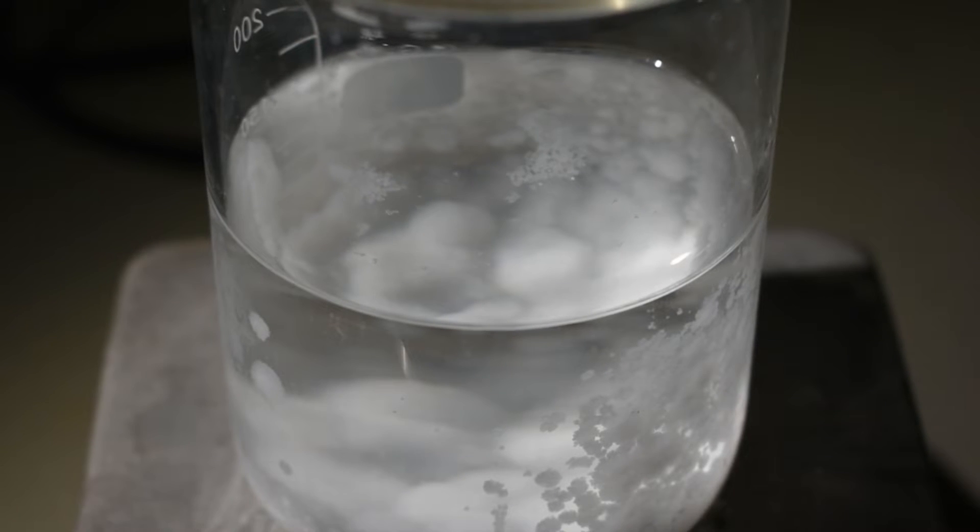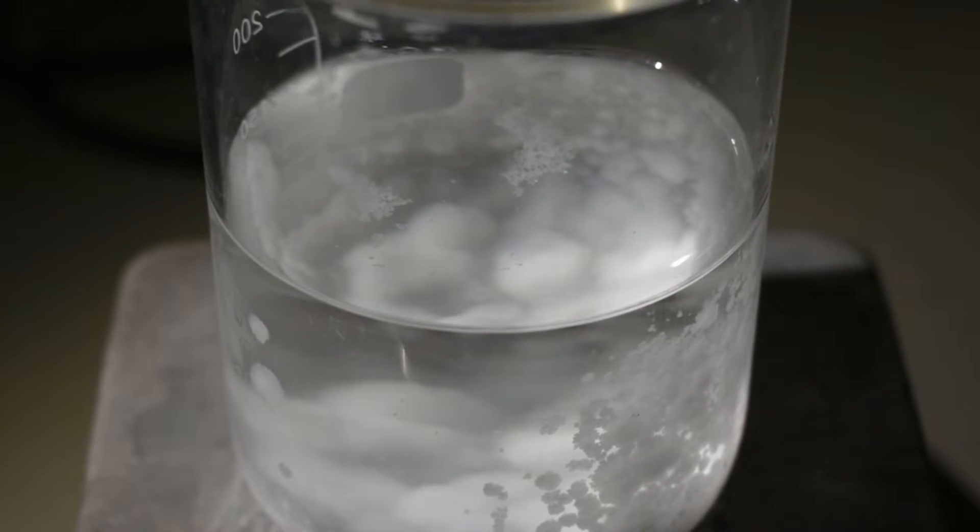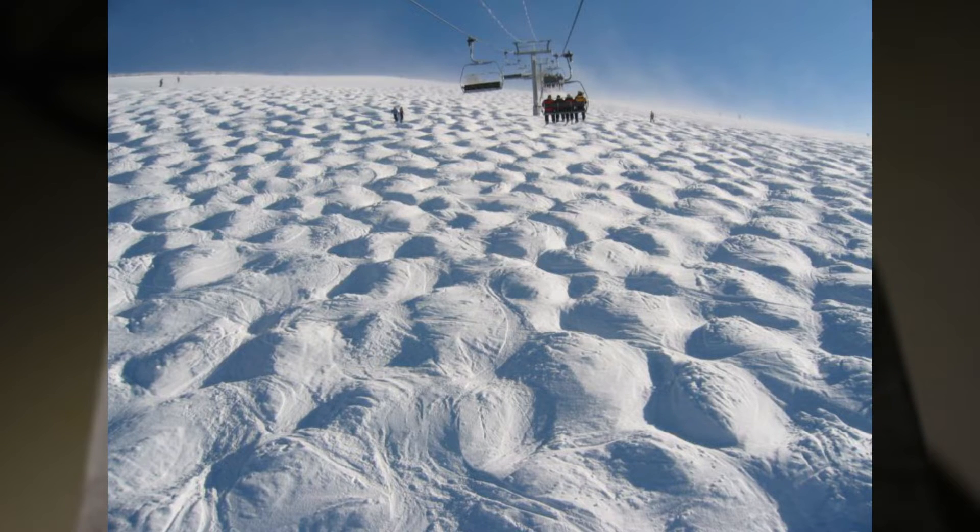So now all I'm left with is this large crystalline mass at the bottom of the beaker, which has a really interesting look to it. It almost looks like packed down snow, or those things that you see on ski hills, I think they call them moguls. Pretty interesting looking.